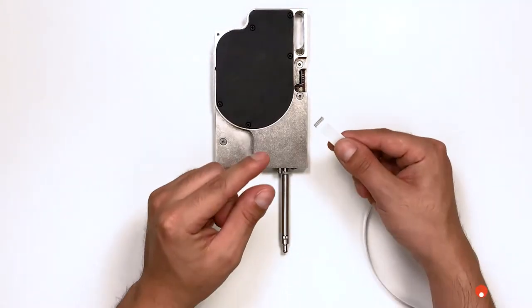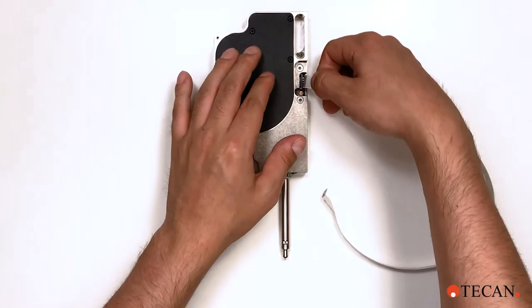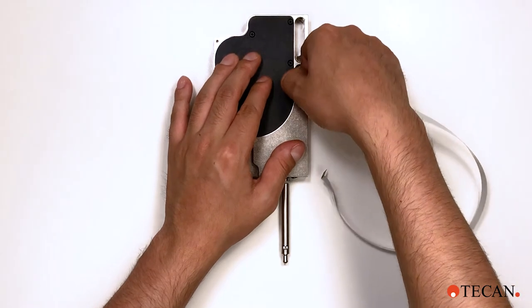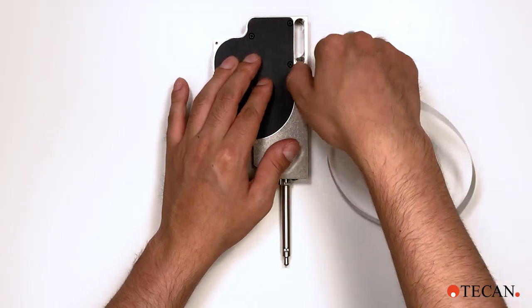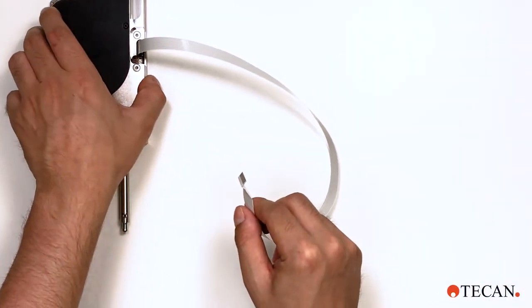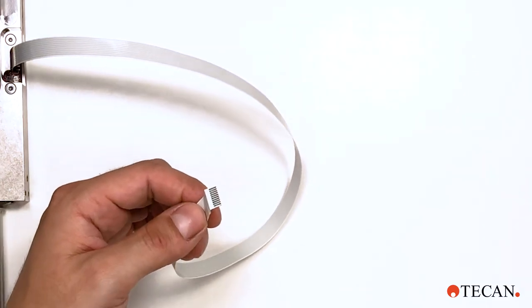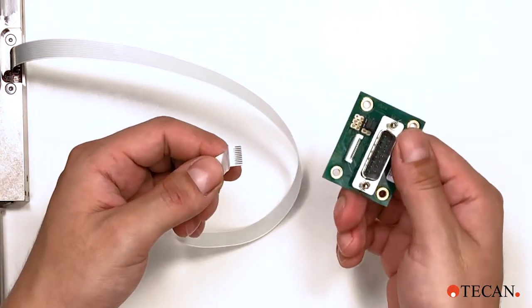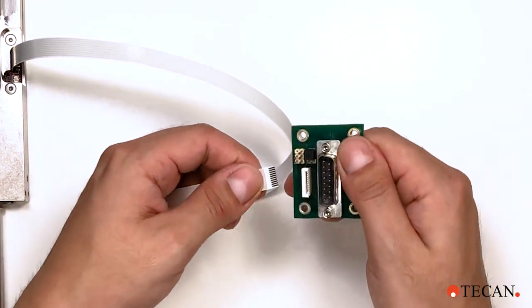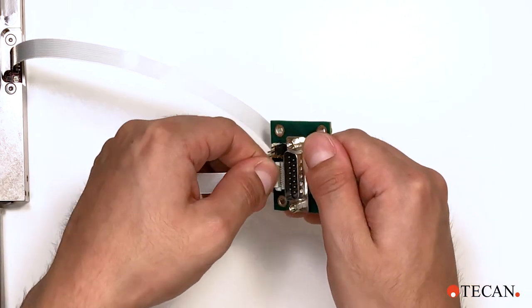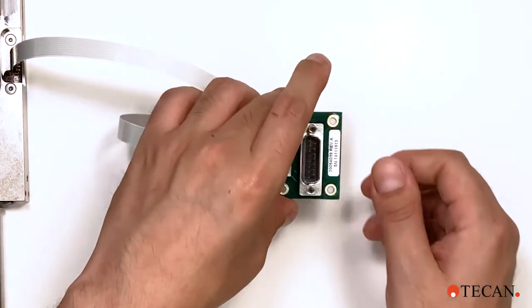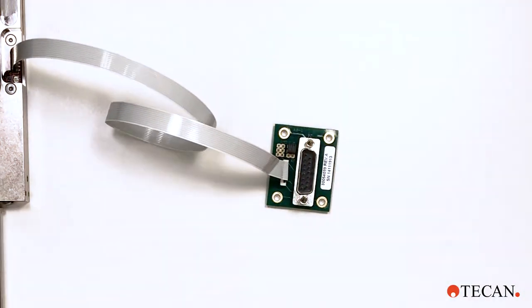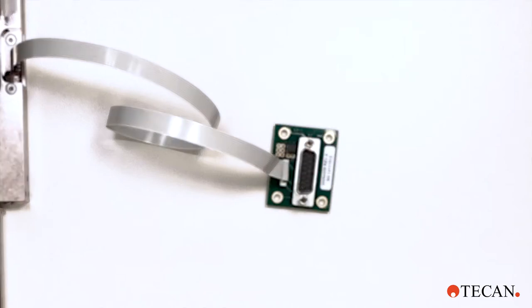Insert the FFC flat flexible cable into the adapter board and the ADP. Note the orientation of the connections on the cable when connected to the board and the ADP. It's important that the contact pins on the ribbon cable are aligned with the contact pins on the adapter board and the ADP. Be sure the cable is fully inserted and straight to ensure good contact and prevent damage.